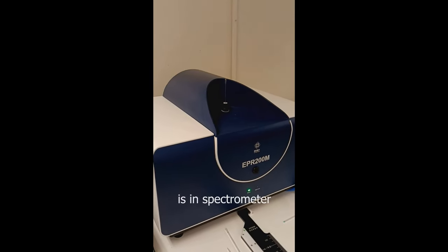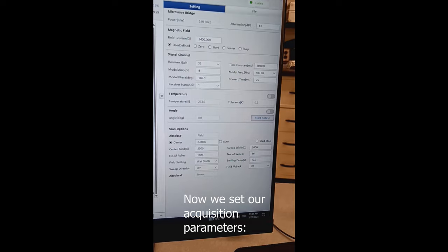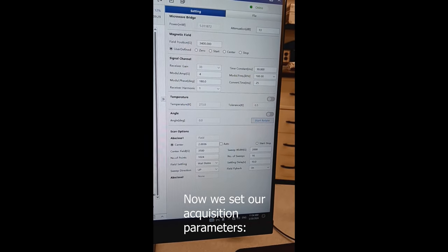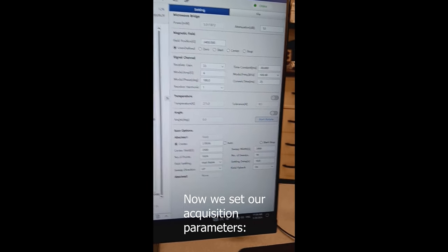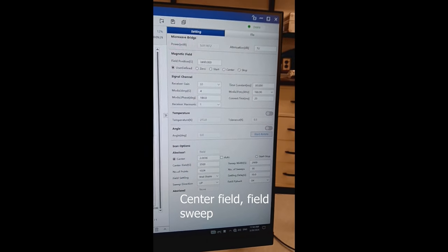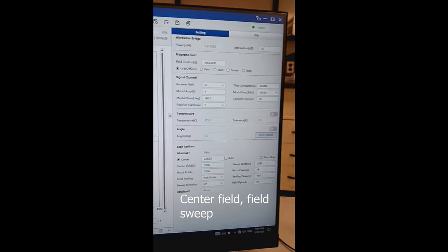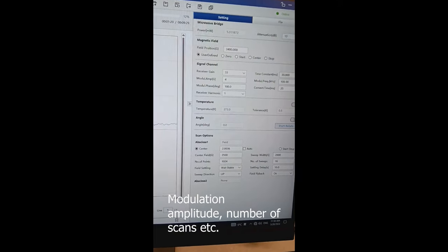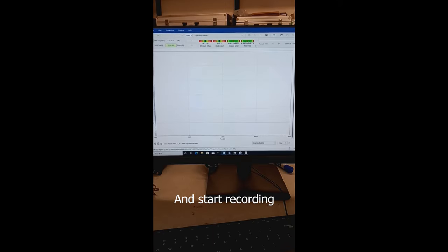Now our tri-radical sample is in the spectrometer. Now we set our acquisition parameters: center field, field sweep, modulation amplitude, number of scans, etc. And start recording.